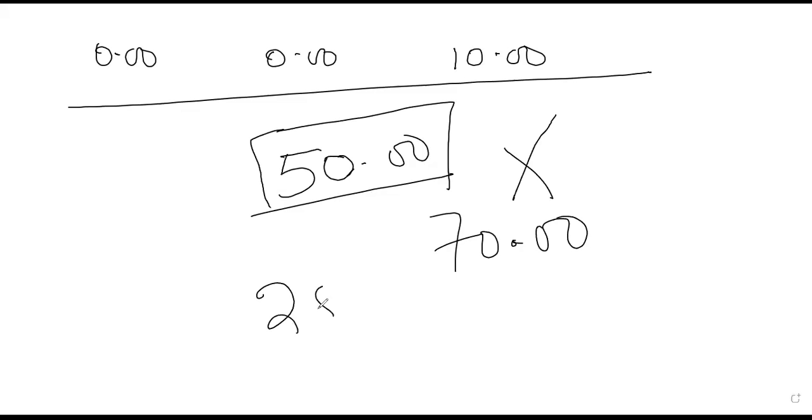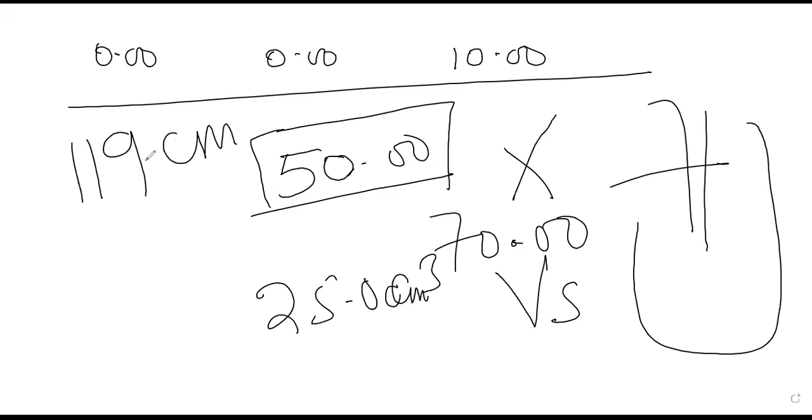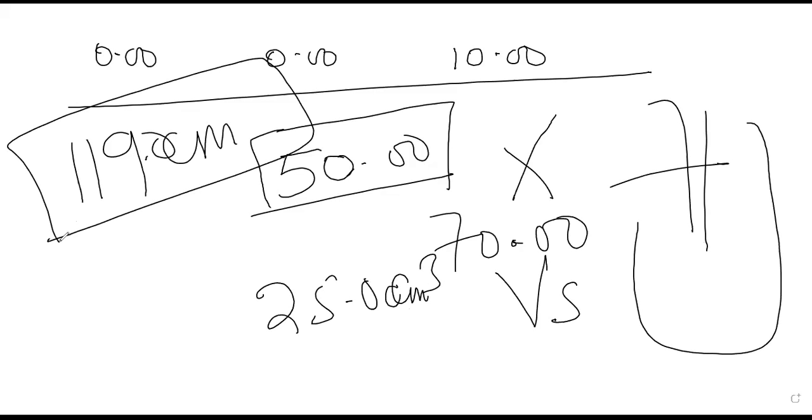If you have pipetted 25 cubic centimeters, it must react against the volume in the burette within the limits of 50 cubic centimeters. If the specification was very clear, last year's titre value was supposed to end in the 40s at least. But since we are recording 119, one just records the value. So to be practical, it will be stopped. It shouldn't go beyond 50 because this is the biggest volume a burette can measure.